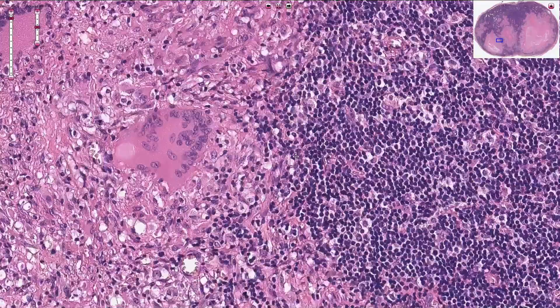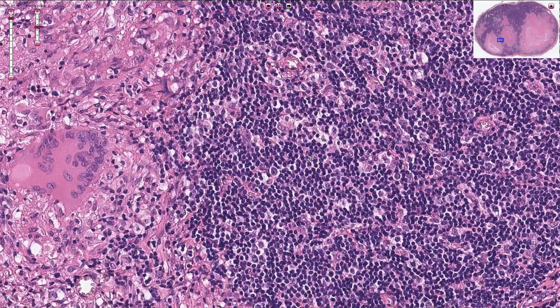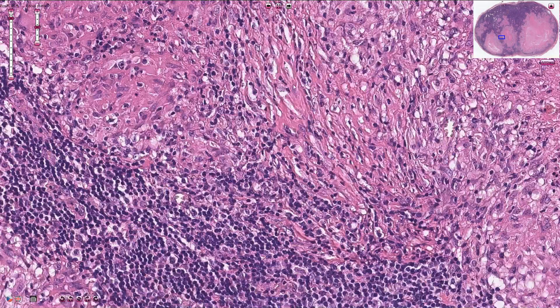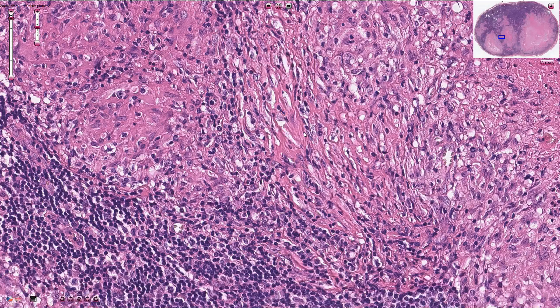Around the epithelioid cells we have a rim of lymphocytes, typically T cells, and farther out we can see some fibroblasts which produce collagen fibers. These fibroblasts try to wall off the process and contain mycobacteria inside the granulomas. Those thin pink strands are collagen fibers, and these spindle-shaped cells with elongated nuclei are fibroblasts.